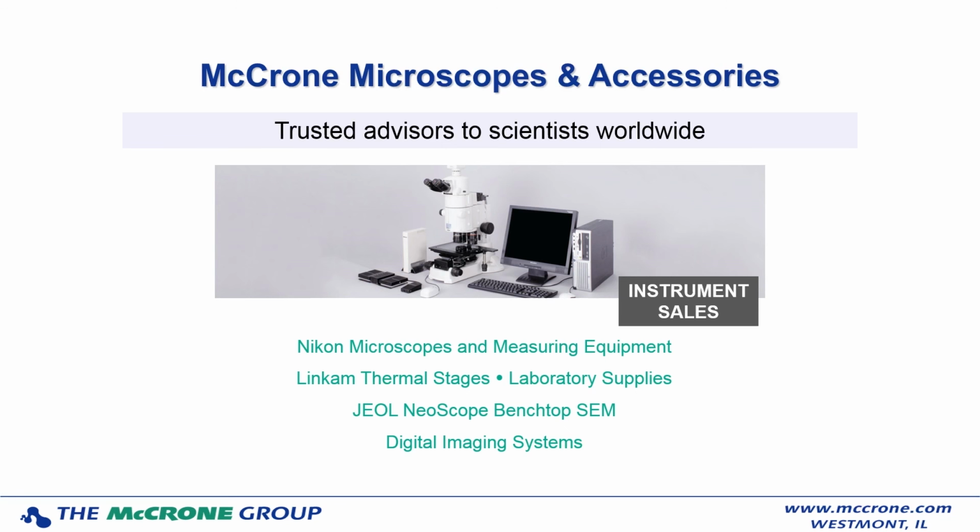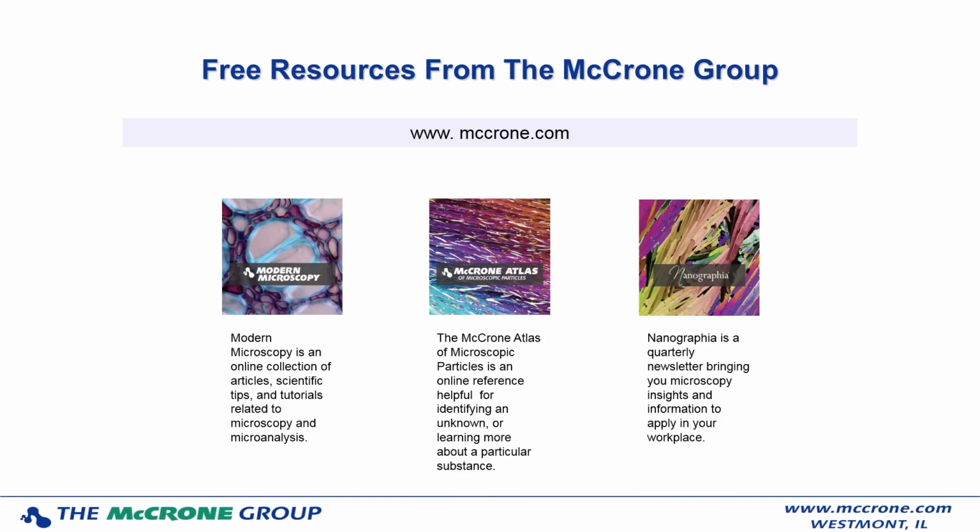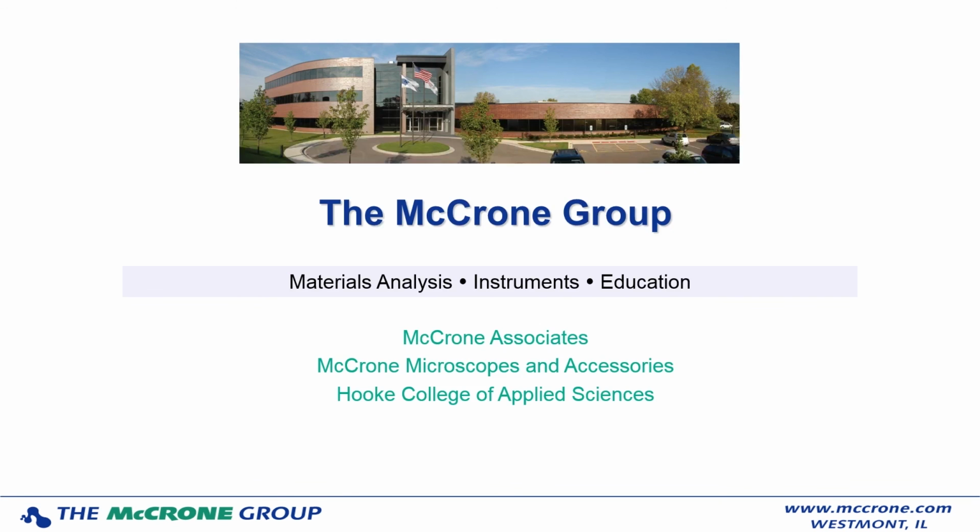Could image software like Photoshop be used to identify percent carbon in steel, ultra-high carbon steel? No, not that I'm aware of. To identify the percent carbon in steel, that generally has to be done by other instrumental methods, not by light microscopy.